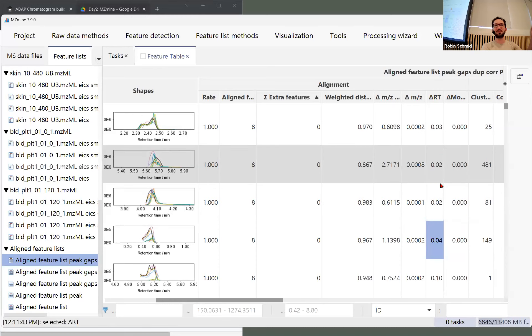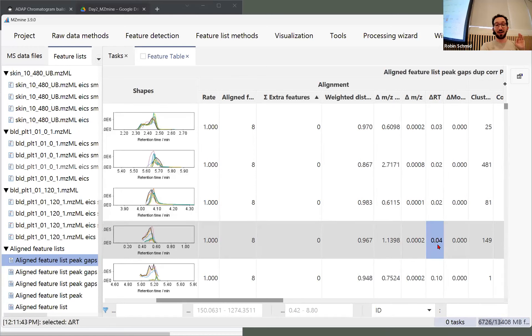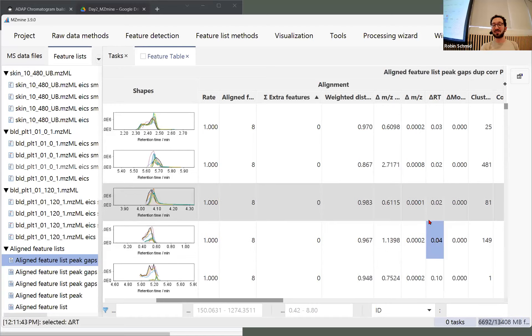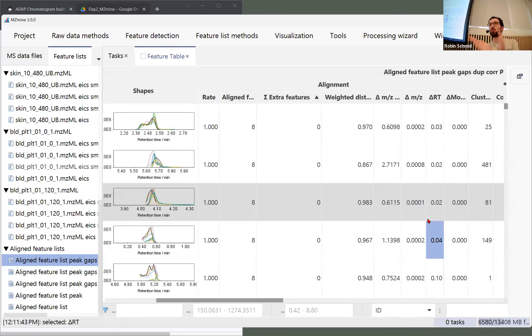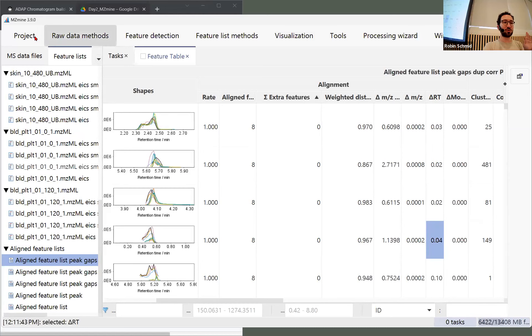I would go through and see what is the maximum difference that still makes sense. The shape might be twisted at certain retention times — you can export the whole table and, if you have Python or R skills, plot this as a histogram to extract parameters. Looking at these eight samples, maybe something like 0.1 would be okay for the retention time tolerance — not too wide, but if we extrapolate to 88 samples there might be a greater shift. So we could start with something like 0.1.